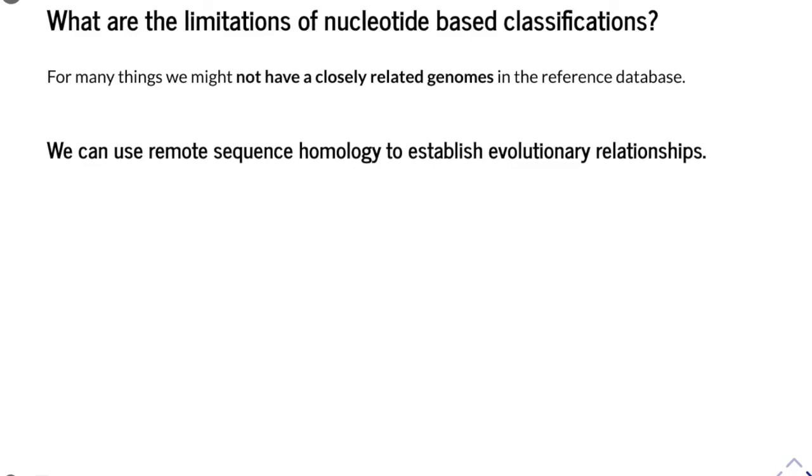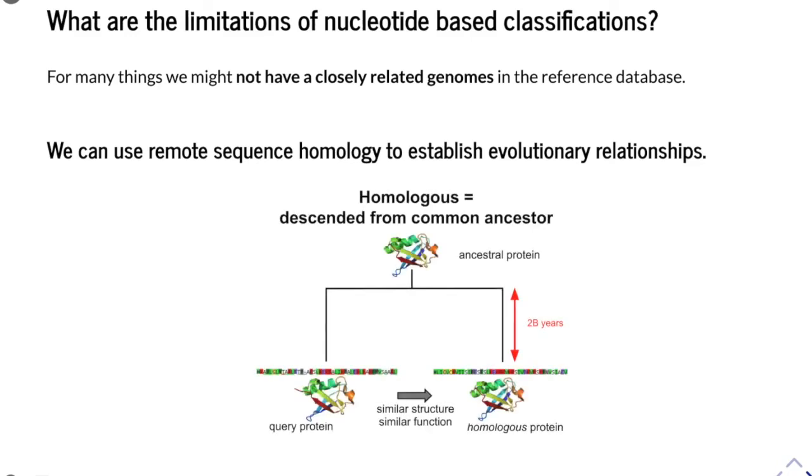But keep in mind, the reason for doing so is if you have a sample and there are things in these samples that might be hard to match to some reference, then you might want to use protein searches. And why do you want to do so? Because proteins are conserved longer, over a longer evolutionary time. What you can see here actually are structures for ubiquitin in human and ubiquitin in yeast.